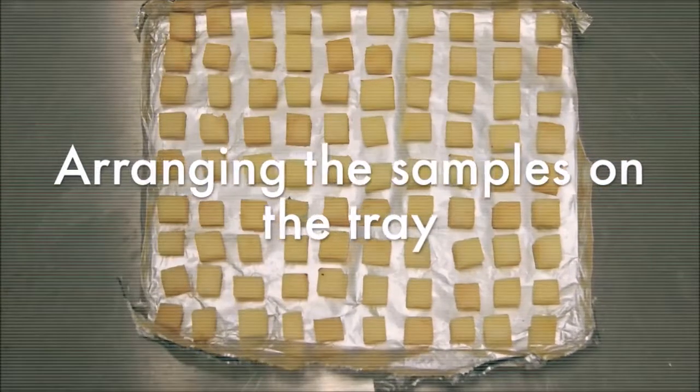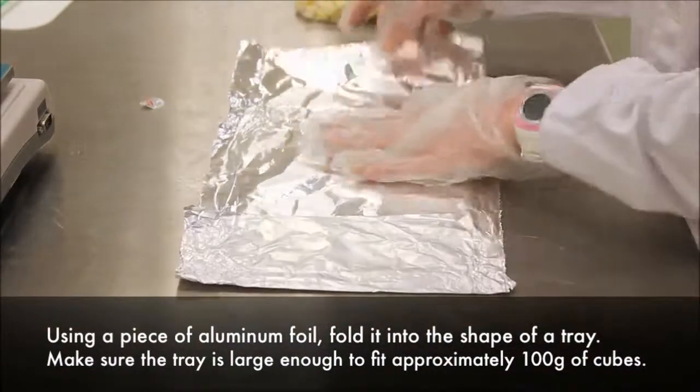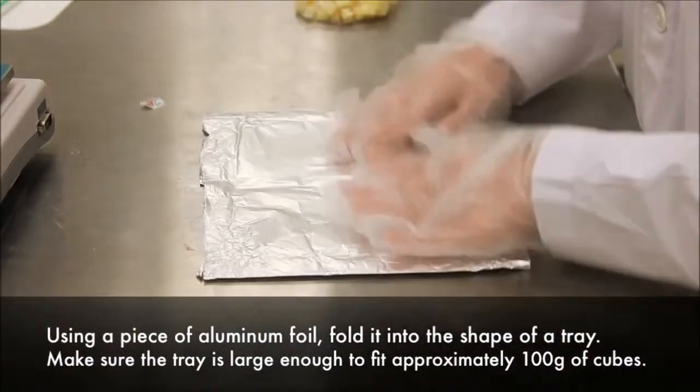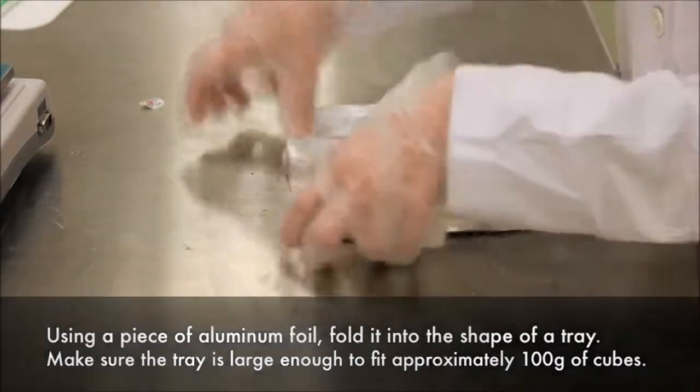Arranging the samples on the tray. Using a piece of aluminum foil, fold it into the shape of a tray. Make sure the tray is large enough to fit approximately 100 grams of cubes.